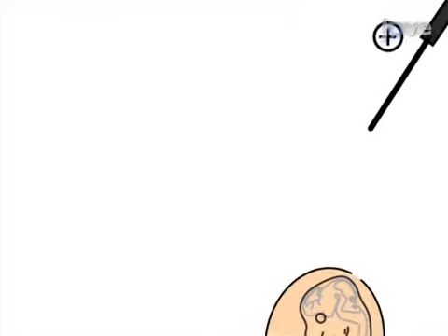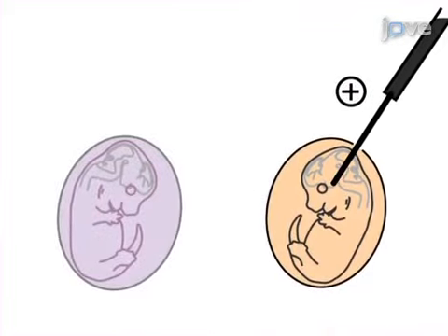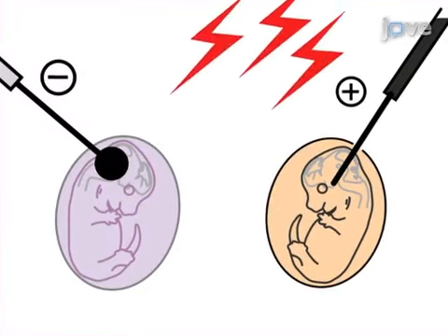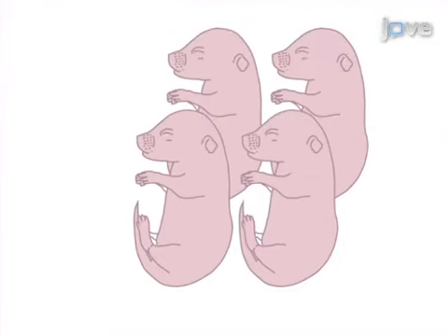Next, the positive electrode is positioned inside the uterus between the placenta and embryonic head, the negative electrode is placed on the outer uterine surface, and electric pulses are applied. The final step is to remove the transfected embryonic brains six days later.